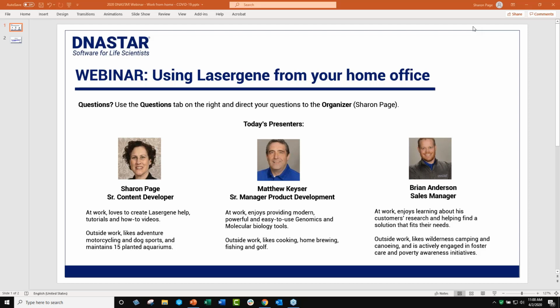Like many of you, we at DNASTAR are working from home right now. We know that a lot of you have installed or are planning to install the extended 90-day free trial of Lasergene that we're offering on your home computer.